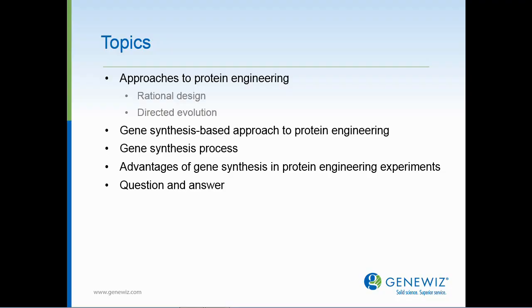Good afternoon. And to those of you joining us on the West Coast today, good morning. The topics discussed today will include an overview of protein engineering and will highlight two commonly used approaches, a rational design and directed evolution. Next, I will introduce a gene synthesis-based approach to your protein engineering pipeline and share a brief overview of the gene synthesis process, before moving into a few advantages to consider and conclude with a question and answer section.